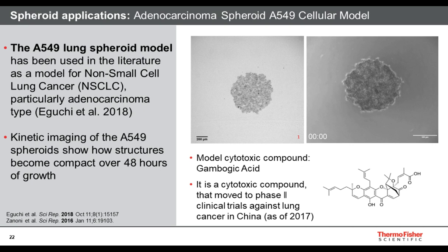We have, as I already mentioned, grown these cells in ultra-low attachment plates, Spheroplates, and we have followed the changes that take place over a number of hours. The majority of the assays that we are presenting today have been performed over 20 hours of spheroid growth, and those spheroids have been treated throughout the presentation with a model cytotoxic compound.